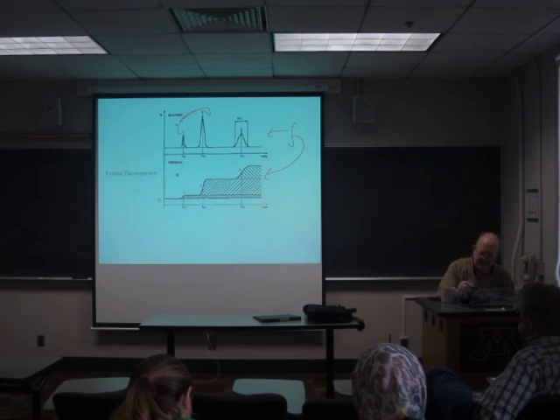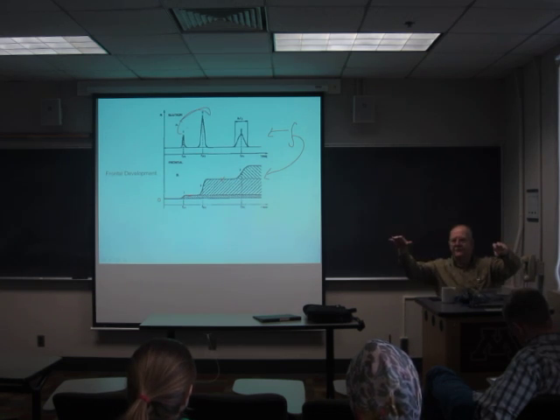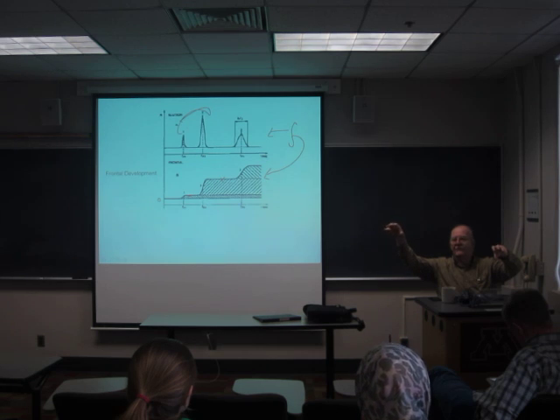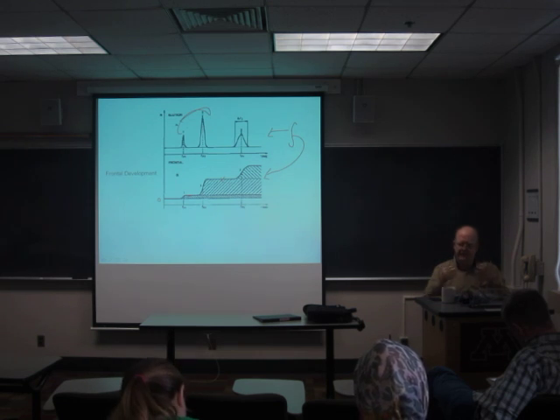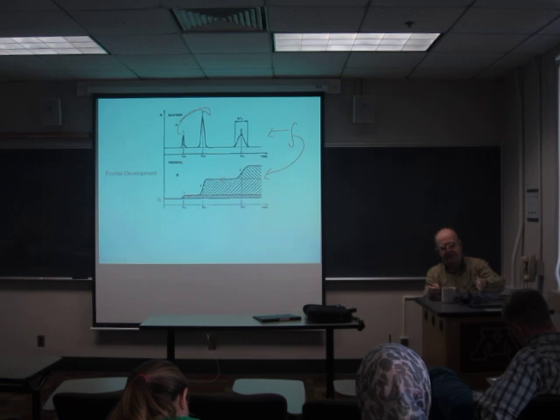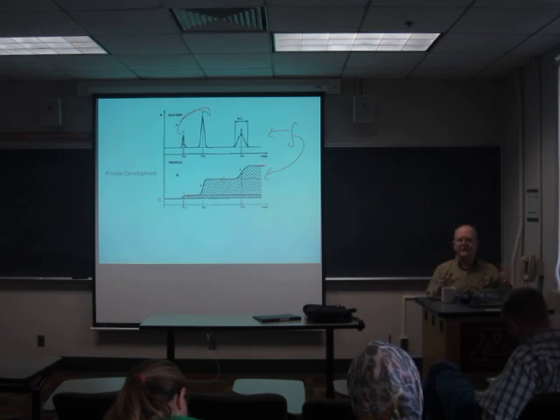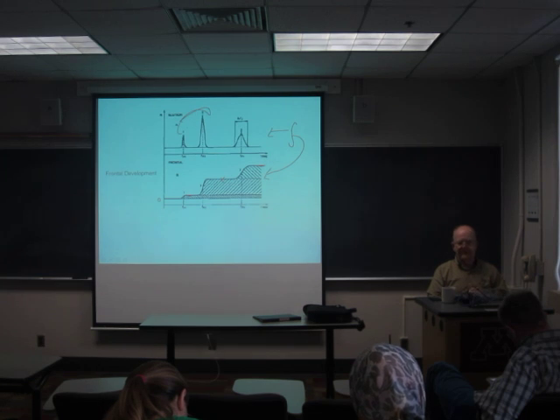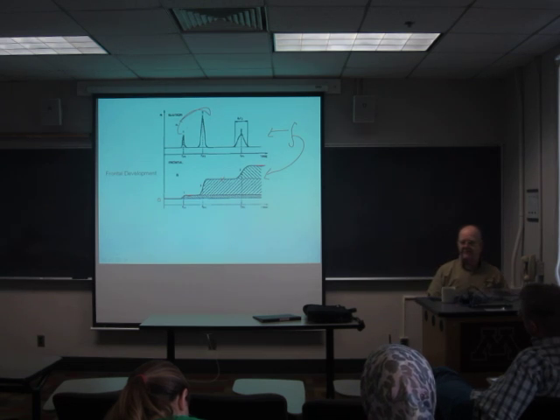Now, in the plateau region here, the concentration of compound 2 that you're putting in is equal to that in every single tube, and it's equal to that which comes out at the end of the column. So it's steady state again, it's another plateau. And then finally, if the separation between 2 and 3 is really good, you will get a third breakthrough. It'll come up, it'll go flat, and at this point, the entire system, every single tube, is filled and has the same concentration of compound 3 as in the first tube, and this is equal to that in the last tube, and it's equal to that which comes out.